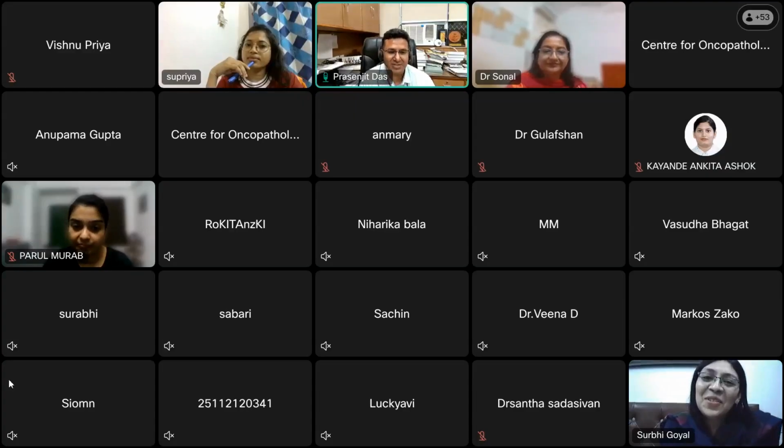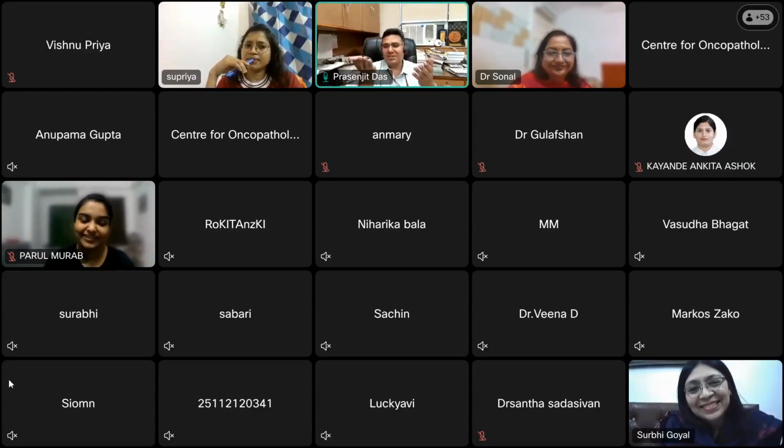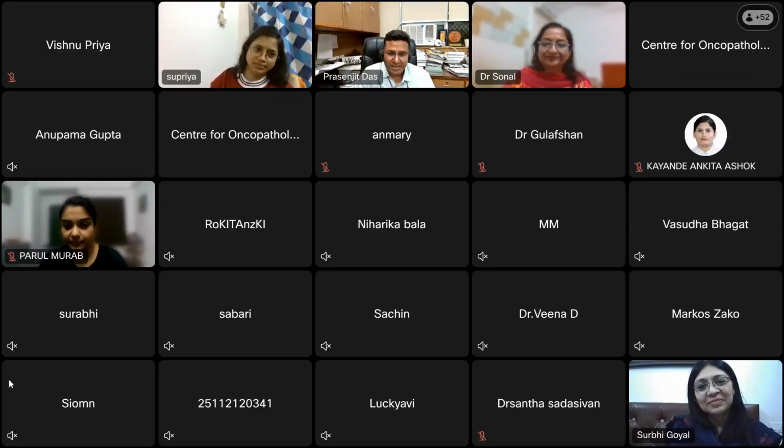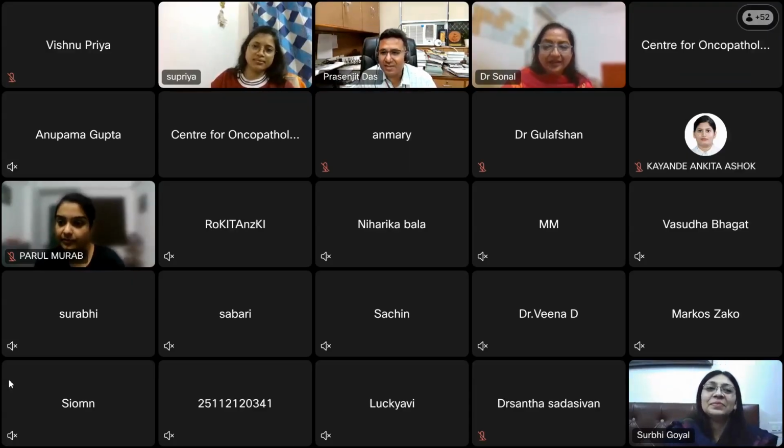Okra and cucumber. What is okra? Okra is bhindi. People cut a cross section of bhindi, fix it in formalin, and that acts like a mounting media. Then put the mucosal fragment on that, orient like that, and whenever you are embedding, you can put it as such and cut through. So that is another way of orienting. Anyway, sir, any other question?